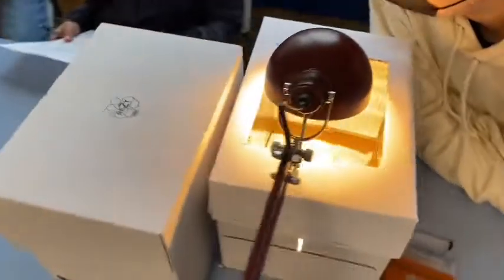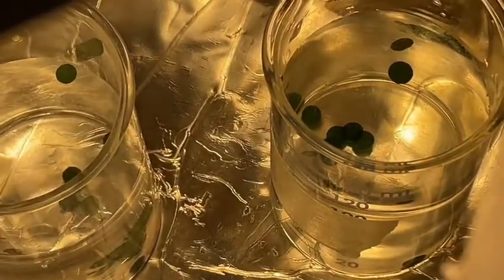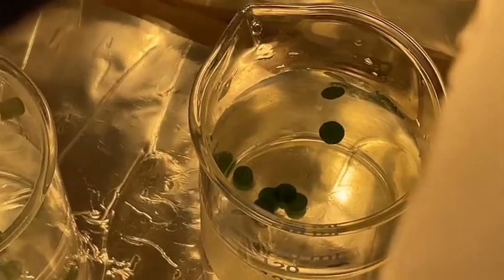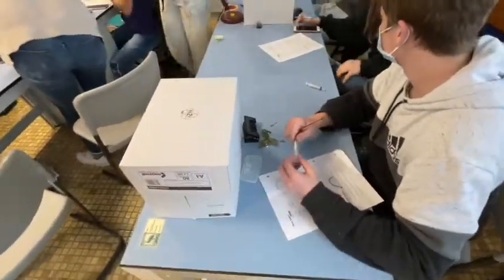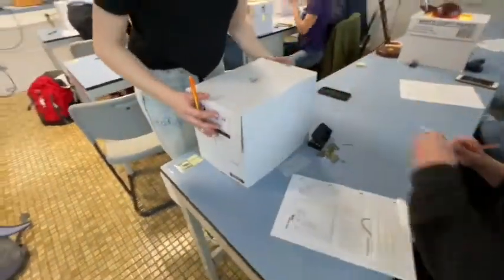All right, are they floating? Nice. All right. Now you guys have 1.5. All right, so the light. Still two? Yeah. Oh, one's rising. That's theirs. Okay. You guys got 2 now. No, it has to be to the brim. Yes, the water needs to go to the complete top. So are any of the ones in the dark floating? I got two. 2 are floating, but none of the others are. Oh wait, this one looks like it's going up.